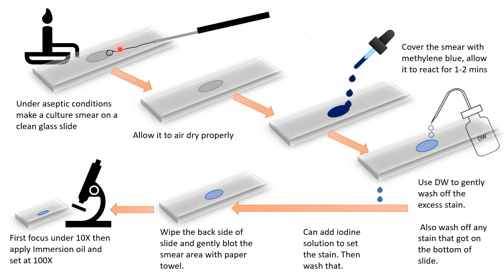For the procedure: under aseptic conditions — always remember, even when making a small smear you must work under aseptic conditions — flame and incinerate your wire loop, then allow your smear to air dry properly. After the smear is air dried, cover it with methylene blue, for example, which is one of the dyes used for monochrome staining, and allow it to react for one to two minutes.